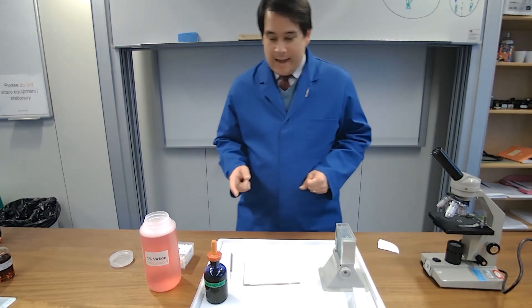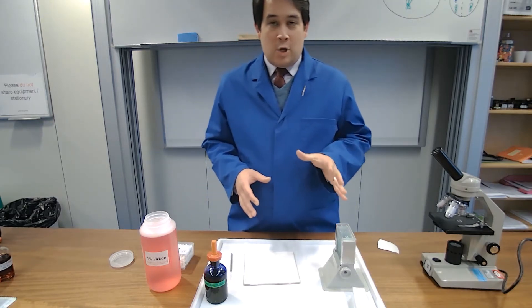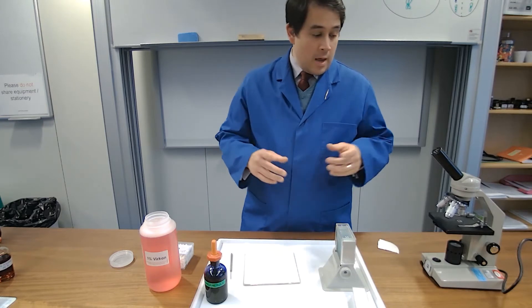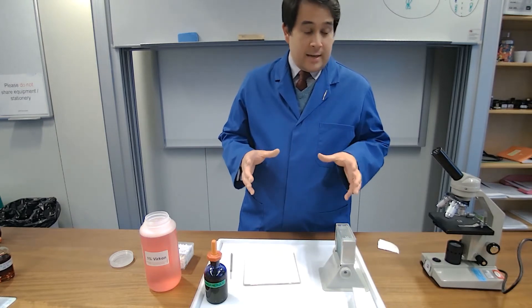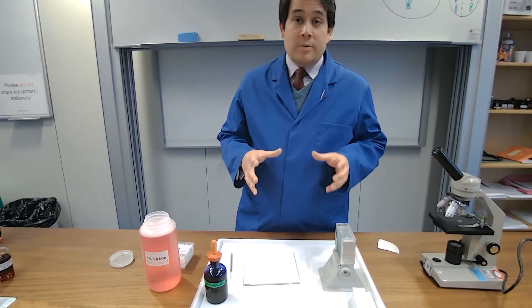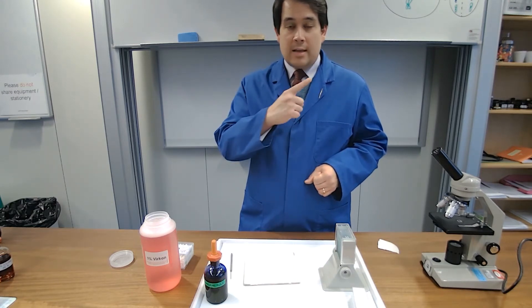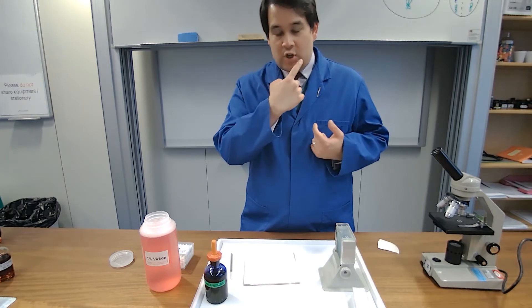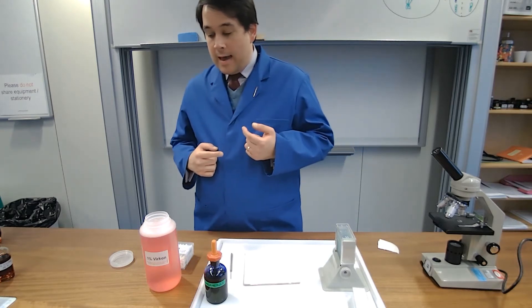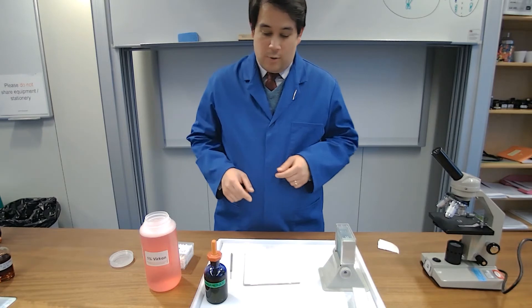Hi, today we're looking at a required practical for AQA GCSE Biology, which is basically the preparation of microscope slides to observe animal cells, which in this case is the human cheek epithelial cells, and plant cells, which is the onion cells, which we'll look at in due course.